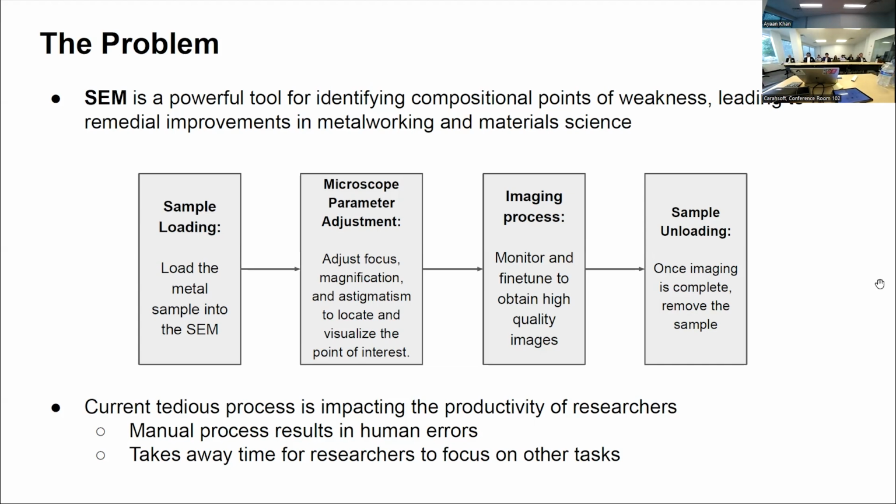Now, altogether, it seems kind of like a basic process, but over a long period of time, across days, weeks, months, and even years of doing multiple analyses on the SEM, it significantly impacts the productivity of researchers. It takes away a lot of time from their hands.